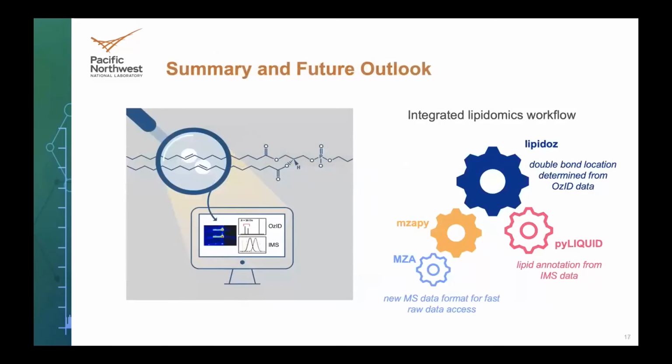So yeah, just to wrap up really fast for sake of time, this application, we're in the final stages of being ready to submit our manuscript on this, and we're going to have all of the API, both the traditional automation and deep learning portions of it. We have a nice Python API with documentation. It's all going to be open sourced, and we'll also have that bundled GUI application for the traditional automation flow.